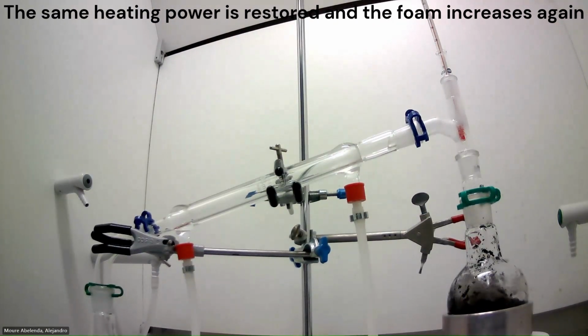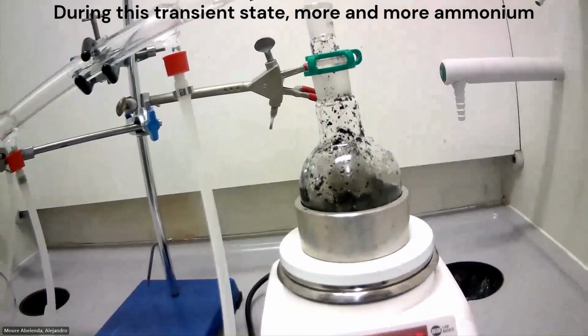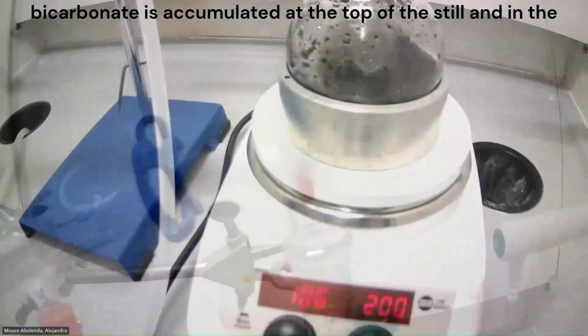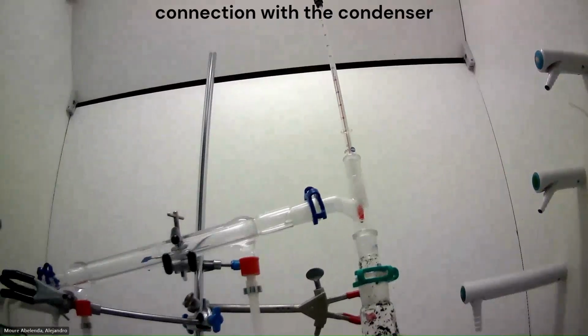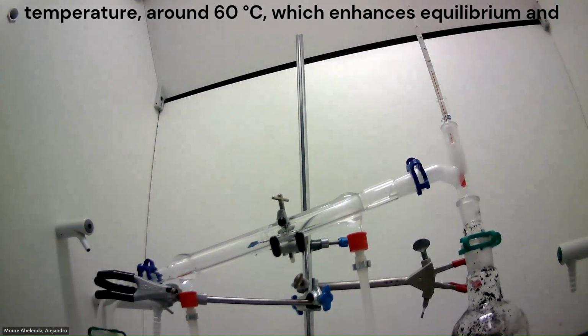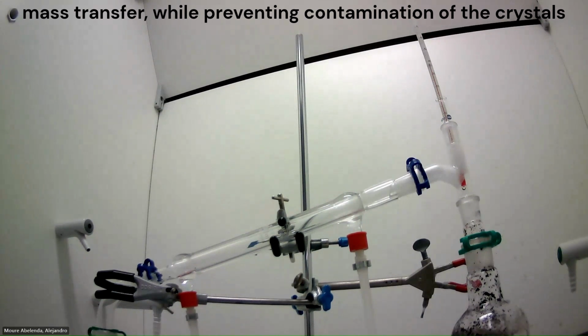The same heating power is restored and the foam increases again. During this transient state, more and more ammonium bicarbonate is accumulated at the top of the still and in the connection with the condenser. Heating is turned on again with the aim of operating at higher temperature, around 60 degrees Celsius, which enhances equilibrium and mass transfer while preventing contamination of the crystals.